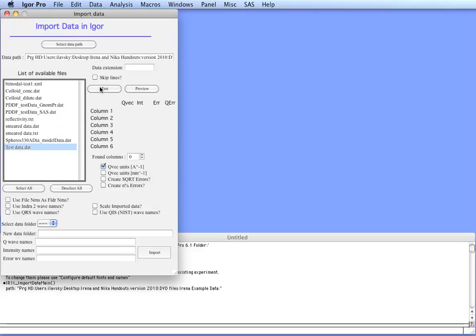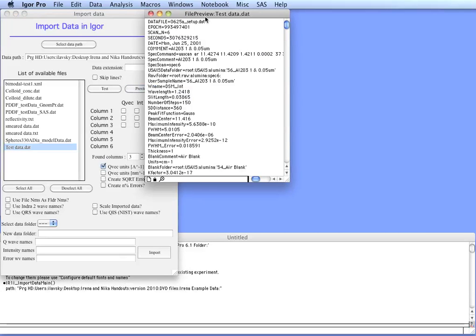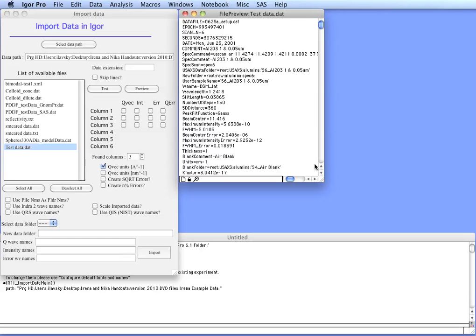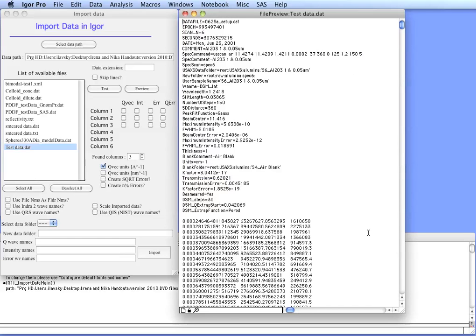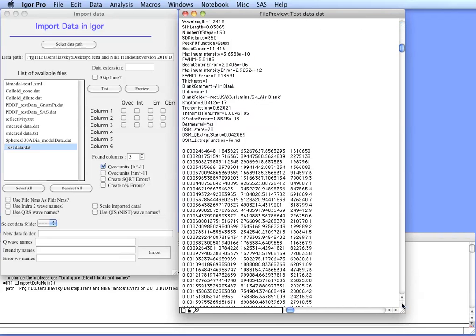If you select it and then hit test, the code will check how many columns of data there are. If you hit preview you can actually see what is there. In this case it's an exported data file from the USAXS instrument, so it has a header containing information. But then it has the thing which really interests us, which is the three columns of data: Q, Intensity, and Error.